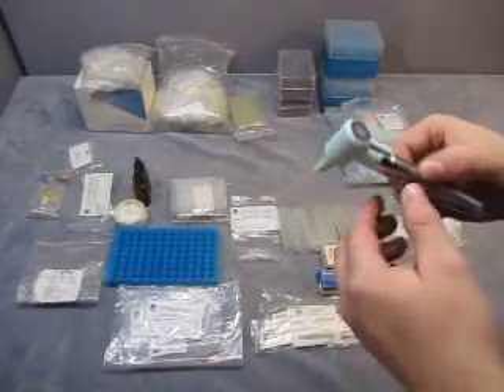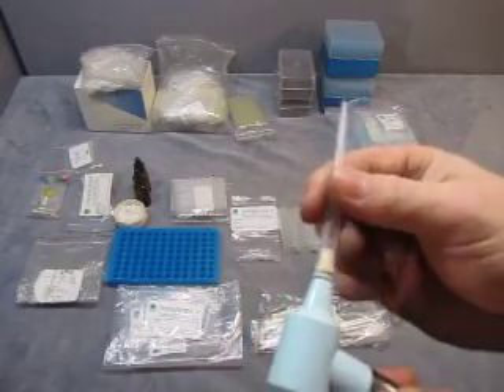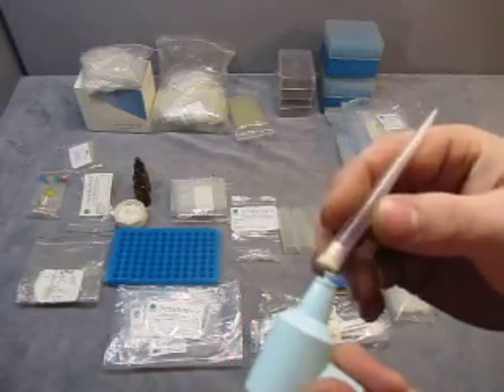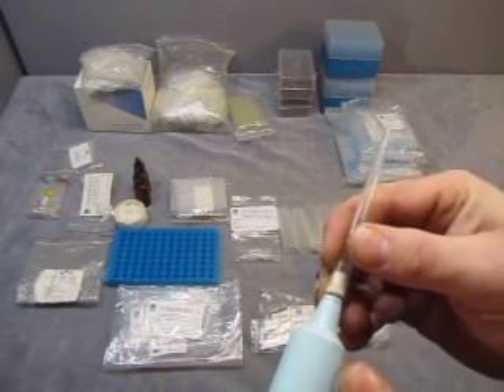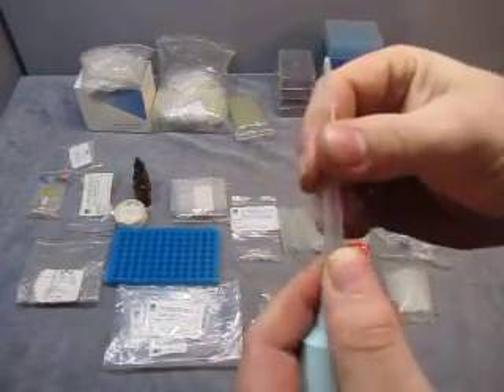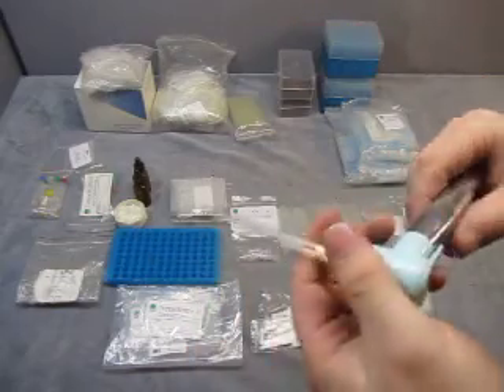Then you get this tool — it says BioSpec Products. That part pops off and pops back on. I think you put the tips on here, but I'm not sure. That's what we have.